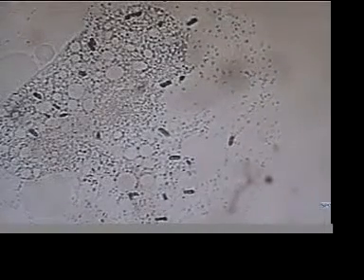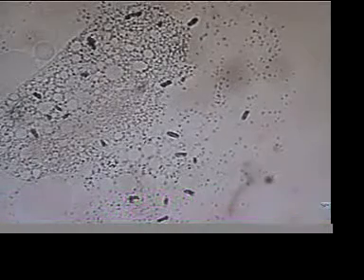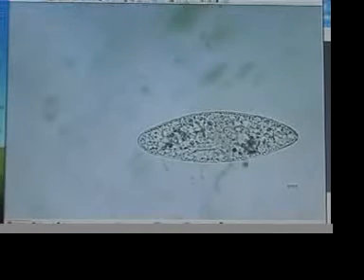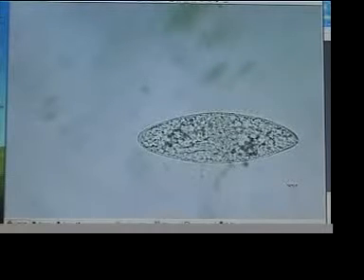And that is the end of a paramecium, caused by a plasma light, a Rife-Bare plasma device, about 6 inches away. 110 watts. SWR 1.18, 1170 hertz, and its 11th harmonic, 12,870 hertz. Here's another organism, a paramecium, who has stopped swimming and is changing shape.